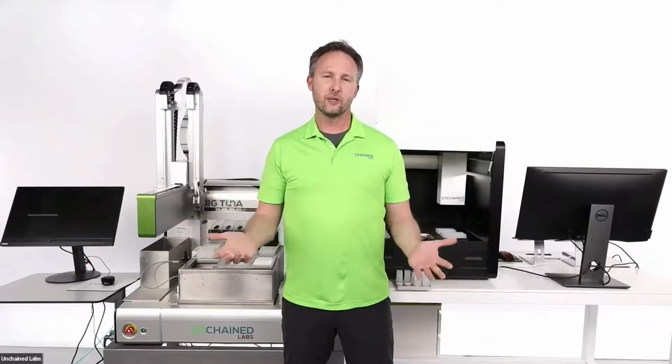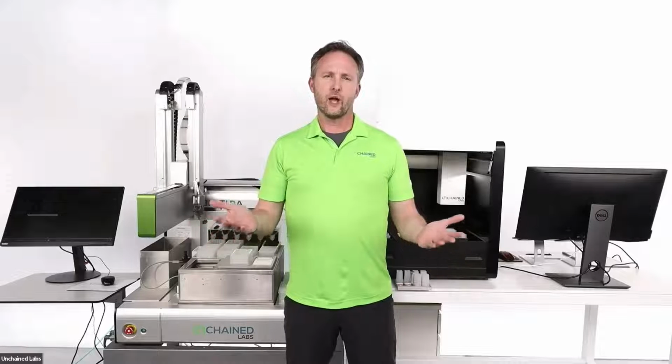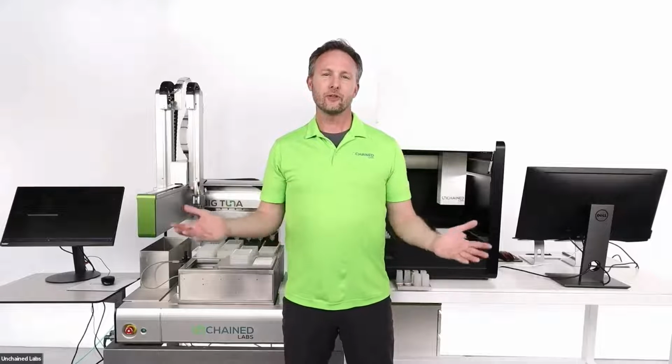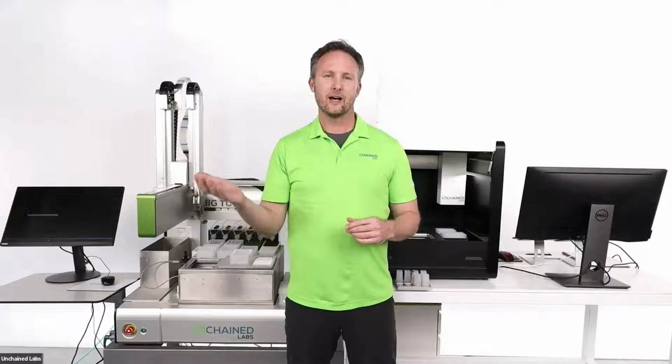That's why it's really fun to be here today to talk to you about not just one, but two solutions that have our proprietary buffer exchange technology, which we refer to as positive pressure-based ultrafiltration diafiltration. Both of these platforms, Unagi on my left and Big Tuna on my right, have this in common. The way that we do buffer exchange is a really cool technology piece. We essentially use, as you'll see in a moment, spoiler alert, the buffer exchange chamber. We are able to apply even positive pressure across all samples, whether you have one or up to 96 of them at the same time.